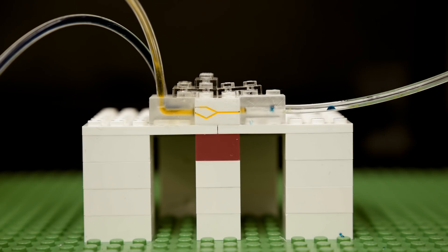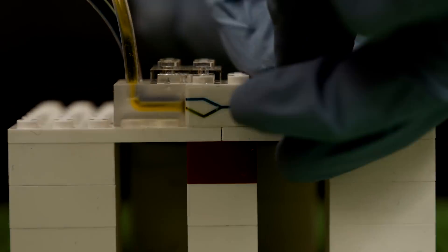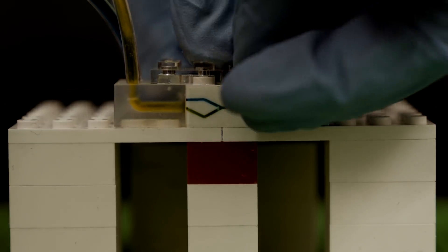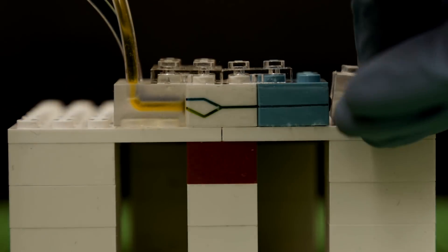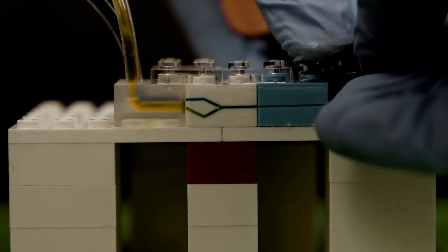Although this is a step in the right direction, the researchers note there are a couple of drawbacks to their method. For example, they are only able to fabricate channels hundreds of microns wide, and some fluidic operations take place at the nanoscale, which is just too small to achieve using micromilling techniques. Also, as LEGO bricks are made from plastic, they likely cannot withstand exposure to certain chemical agents.